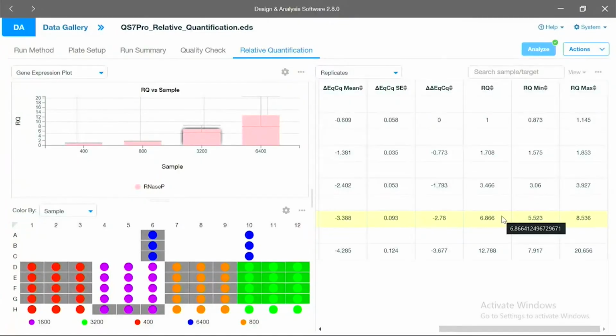We can look at it. But the big difference, and hopefully I mentioned this at some point today, is that when you're working with TaqMan assays, you're actually going to degrade that probe to generate your fluorescence signal. So that is inherent. We're not going to be able to go back and reassemble that probe and turn off the signal so we can turn it on, which is really important for a melt curve.